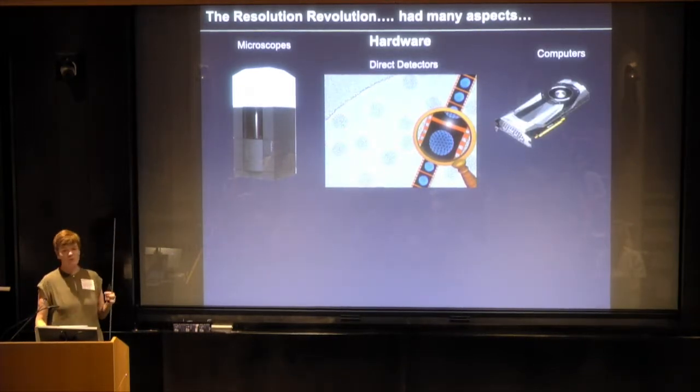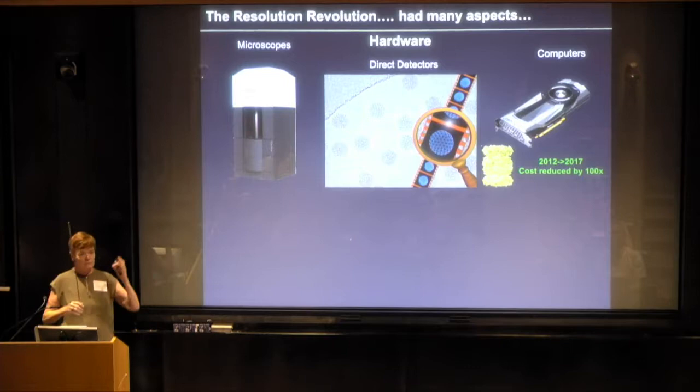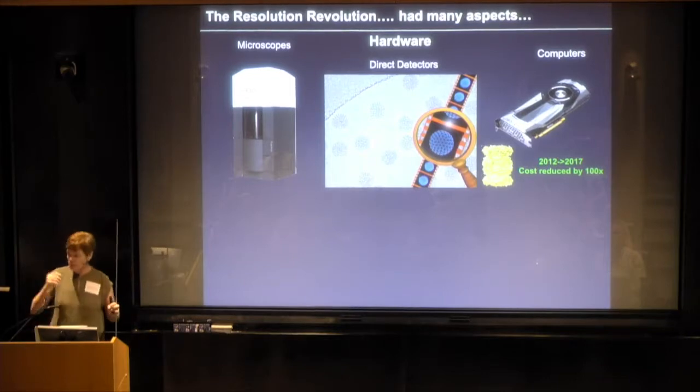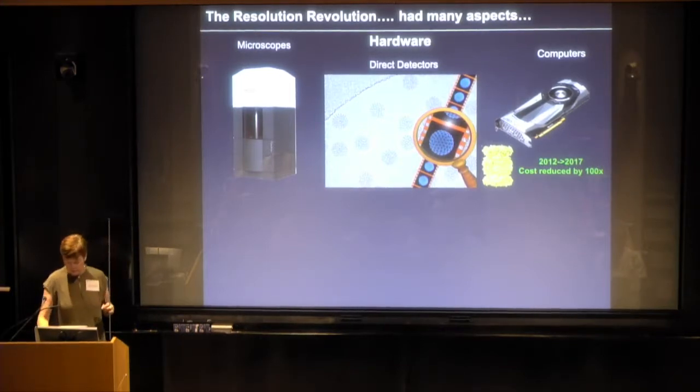And then computers advanced enormously, of course. That first 3 angstrom structure we did in 2014 or wherever it was took us 10 CPU years. We begged and scraped every CPU at Scripps for 3 months to try and get it done in time for a meeting. I'm sure you can do it now in 20 minutes, and that's a direct result of the huge advances, especially in GPUs, which the gaming industry has driven. And so now we're doing everything incredibly fast.